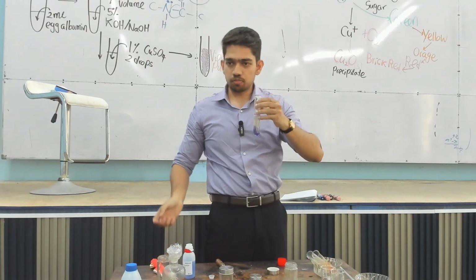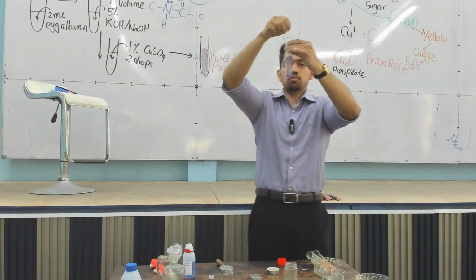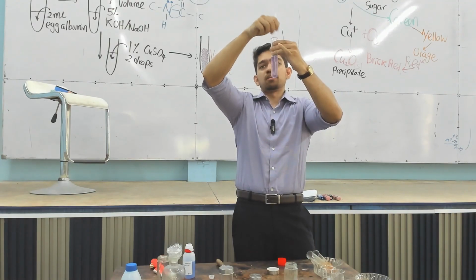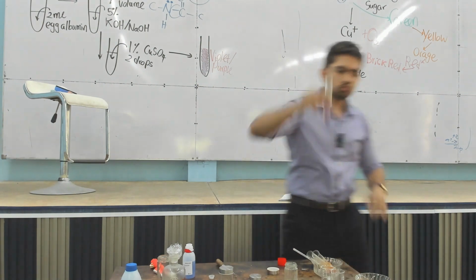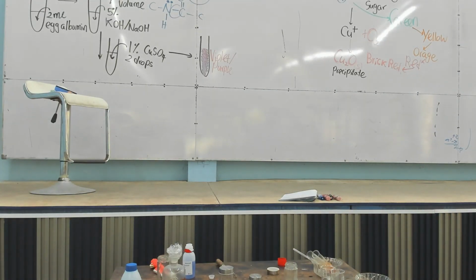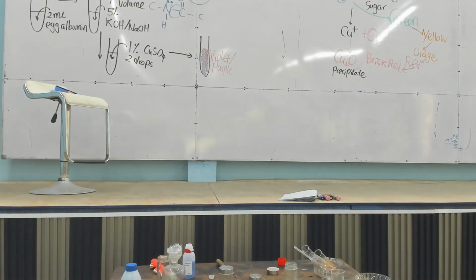Online people, it's not my purple shirt. You can mix this a bit. It has coagulated a bit, the white has coagulated a bit because of the heat. Can you see? It's exactly the same color. Got it? So this is the positive Biuret test. We can, for fun, try it for other things such as a bit of milk protein.